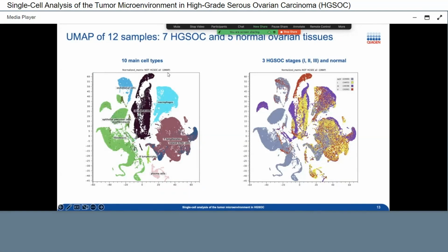I don't think it was the point here, but we have basically macrophages, T lymphocytes, natural killers, a bunch of plasma cells, fibroblasts all over the place here, endothelial cells, some myofibroblasts, some B lymphocytes, right? And a huge chunk of epithelial cell line. This is the representation as is, everything confused, normal and cancer tissues.